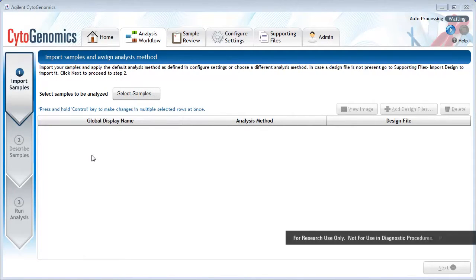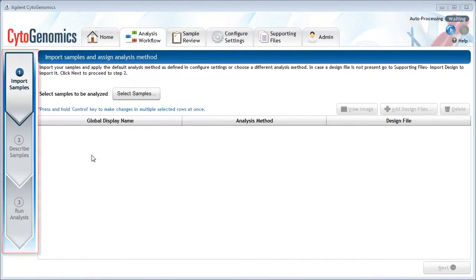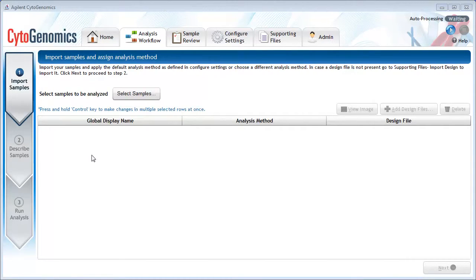This video tutorial describes how to manually set up and run an analysis workflow on your microarray sample data. This is done on the program's Analysis Workflow screen. Displayed on the left of the screen are the steps for setting up and starting the analysis workflow.